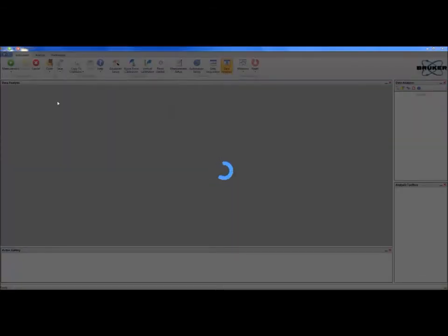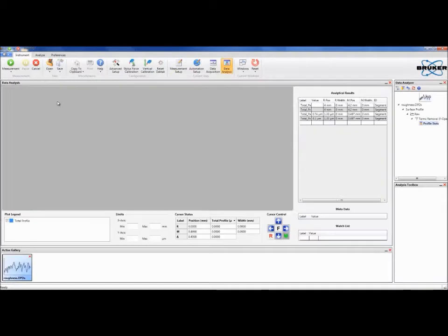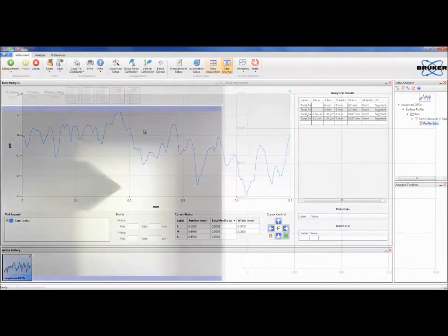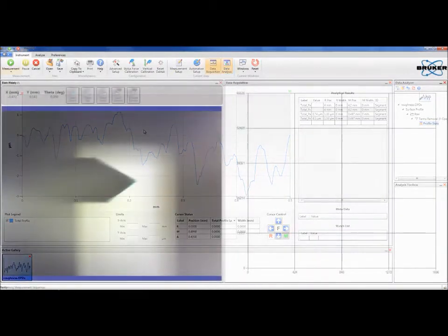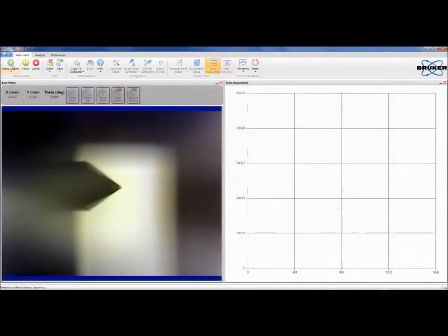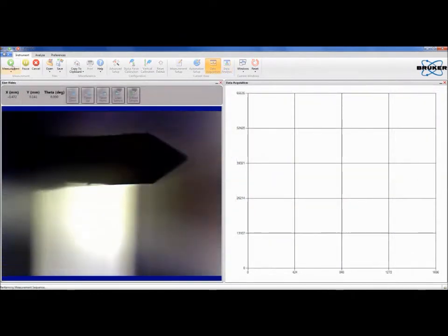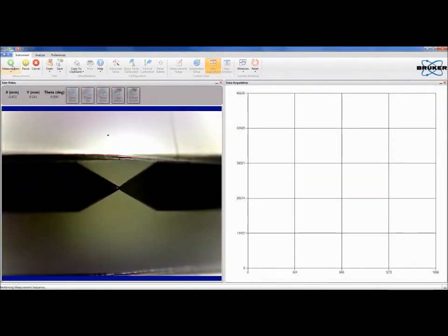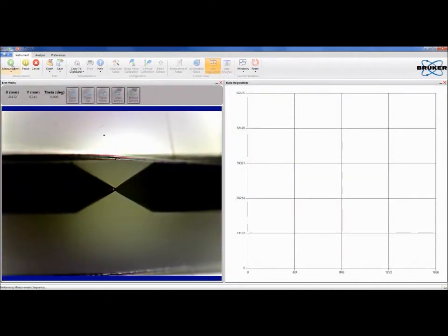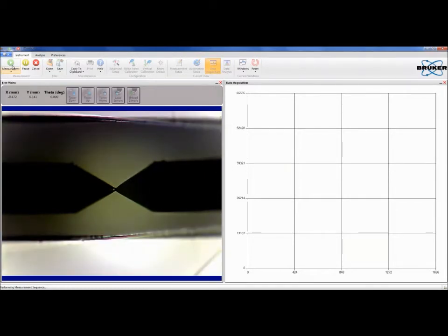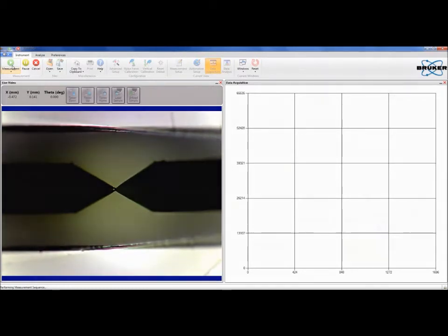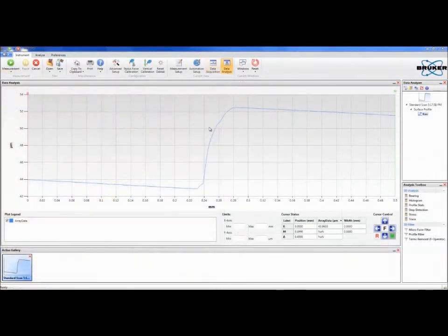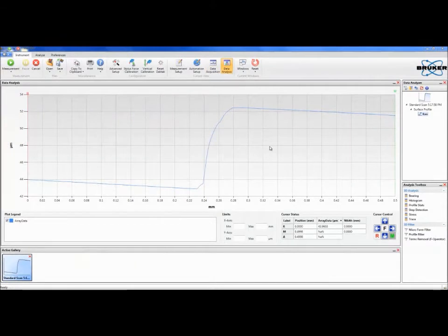Vision 64 assists the system operator in acquiring sample data quickly. It has been specifically designed to create an intuitive user experience. Vision 64 simplifies operator interaction with the system, from sample setup to sample measurements and subsequent data analysis.